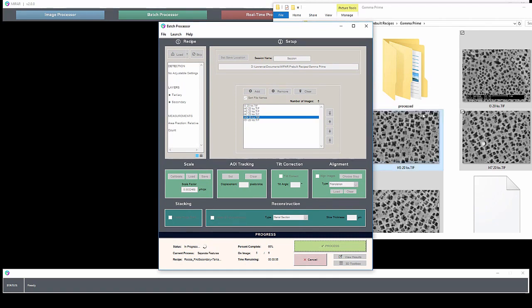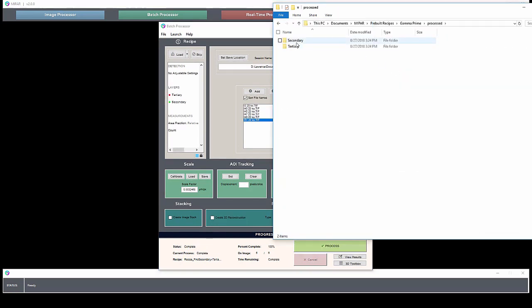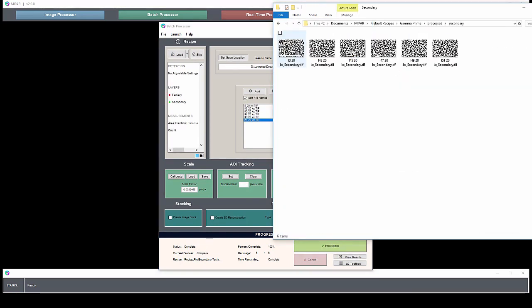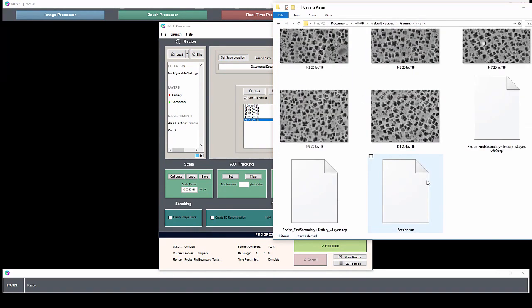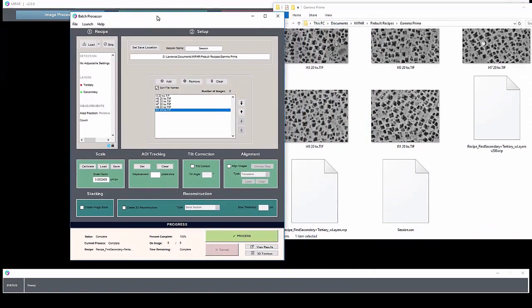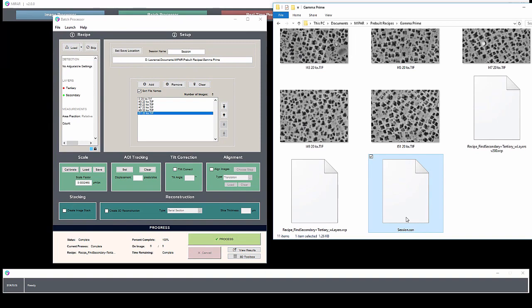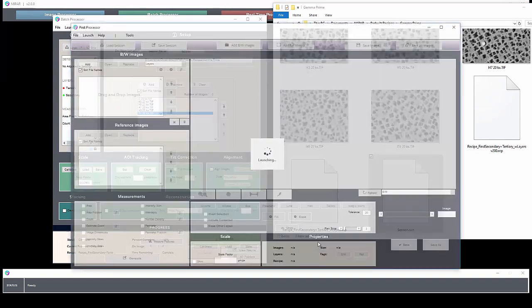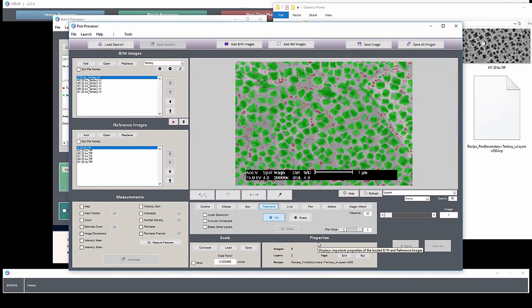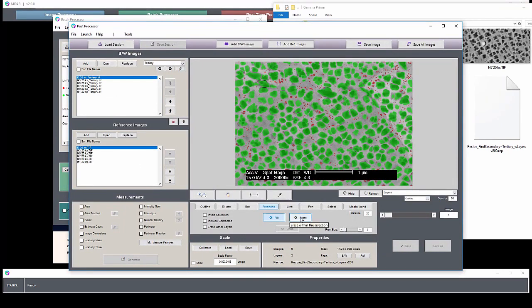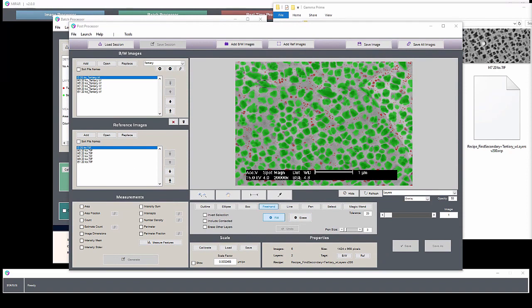Layers and measurements are going to be stored in the selected location here. Once the recipe has finished running on all the images, you can load them in the post processor, either by hitting view results or by opening up the SSN file. Here in the post processor, you can perform manual cleaning if necessary and collect more measurements.